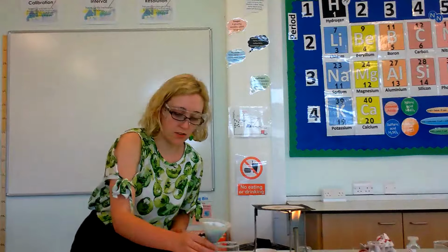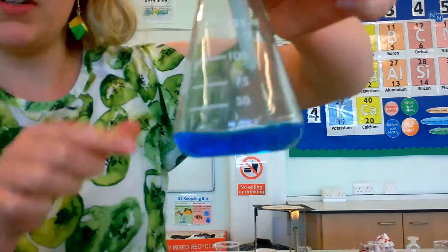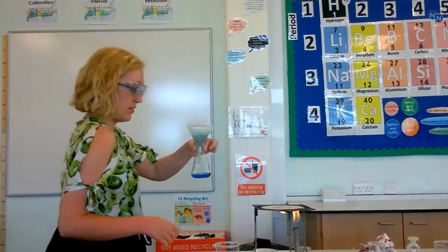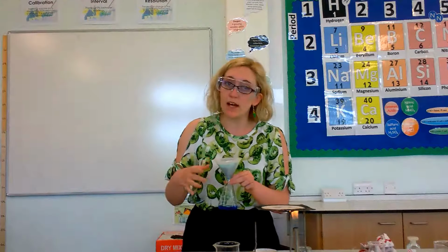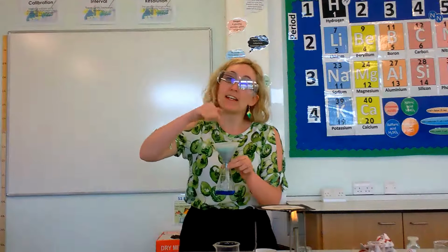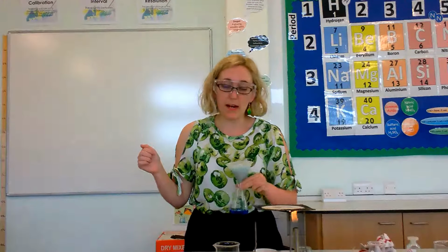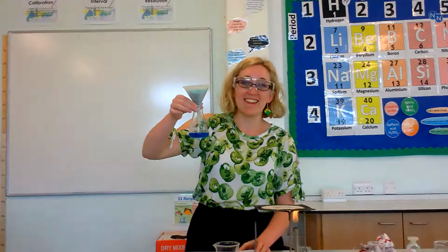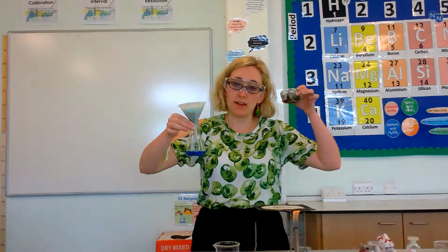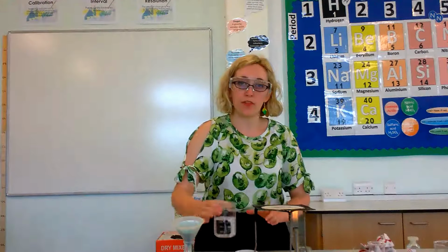And coming out of this conical flask, I have this beautiful blue liquid. That is now copper sulfate dissolved in pure water. Any spare copper oxide powder that I had is collected on the inside of the filter paper, so it looks like I've got lots of black powder in there. We wait for it all to funnel through, and then we're going to place it into this evaporating basin. While that happens, I'm going to explain what this is for.